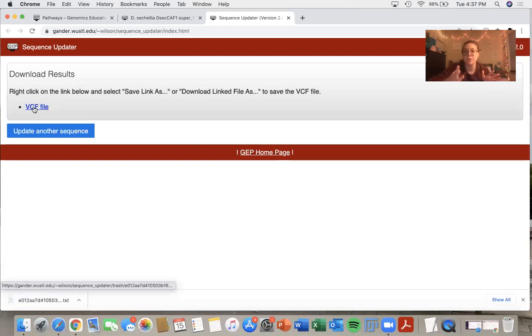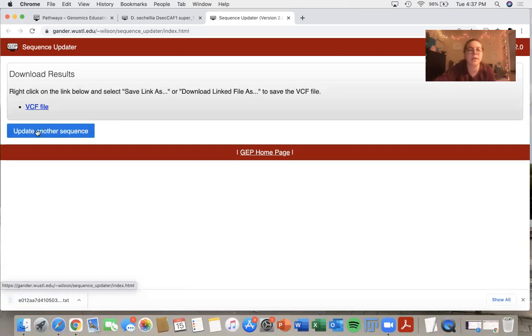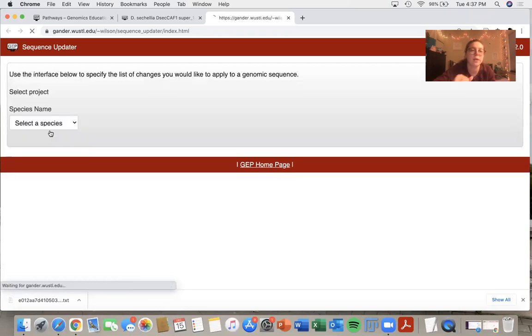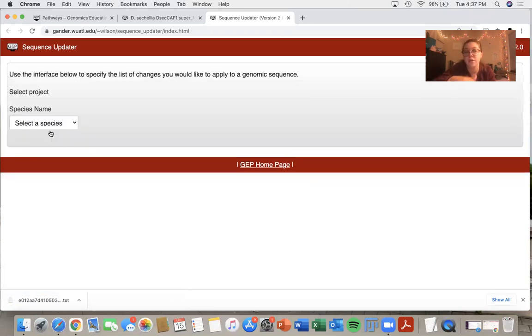However, your computer needs to download a file. And if I wanted to update another sequence, I would simply select update another sequence and it would bring me back to that first page of the sequence updater.